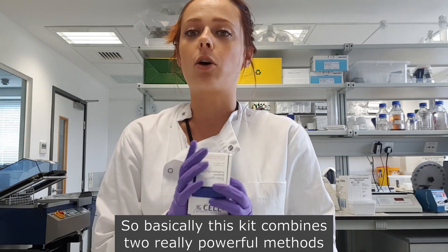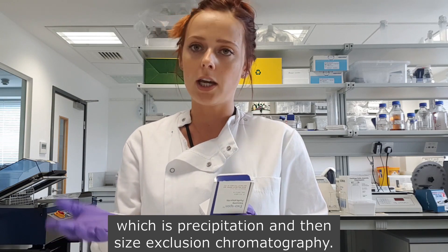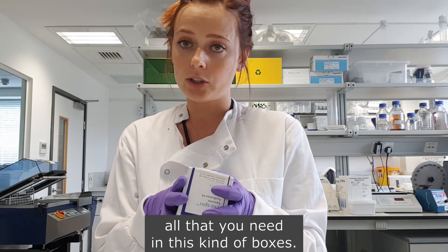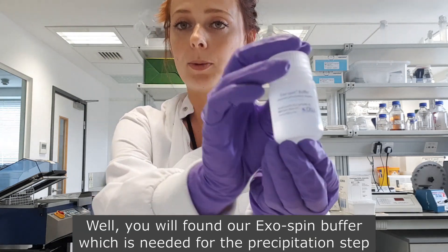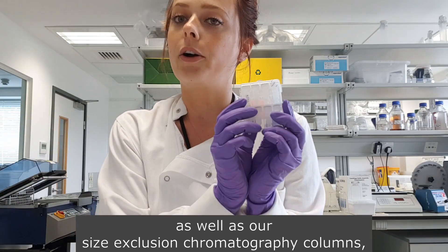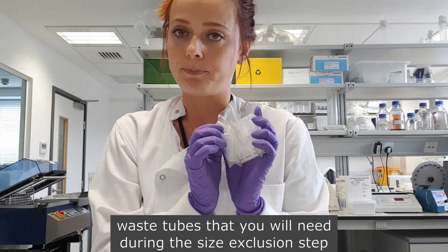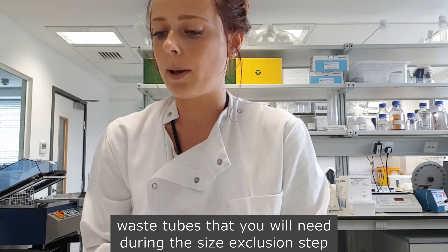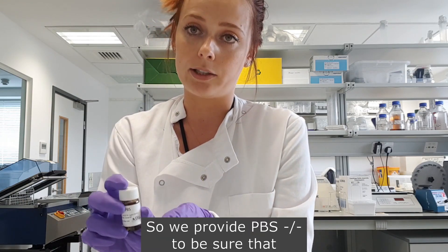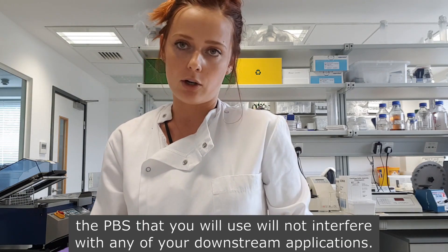This kit combines two really powerful methods: precipitation and then size exclusion chromatography. We ship everything you need in the kit. You will find our Exospin buffer, which is needed for the precipitation step, as well as our size exclusion chromatography columns, waste tubes needed during the size exclusion step, and we also provide PBS minus minus to ensure it will not interfere with any of your downstream applications.